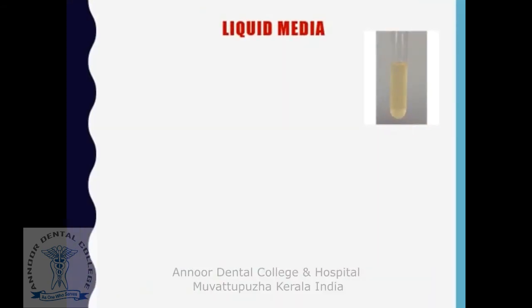About a liquid culture media, it is used mainly to prepare bulk cultures. Bulk cultures means when you want a large quantity of growth of bacteria, usually for the production of antigens and vaccines, we prefer a liquid culture medium.